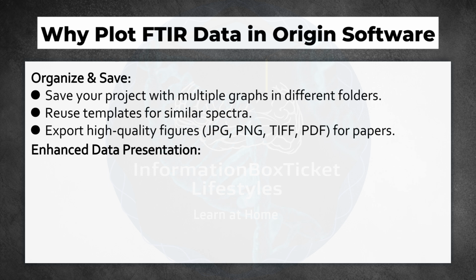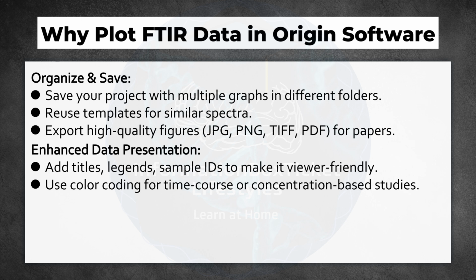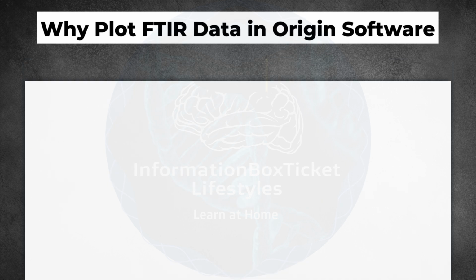Enhanced data presentation. Add titles, legends, sample IDs to make it viewer-friendly. Use color coding for time course or concentration-based studies. Highlight degraded, shifted, or new peaks for biodegradation analysis.